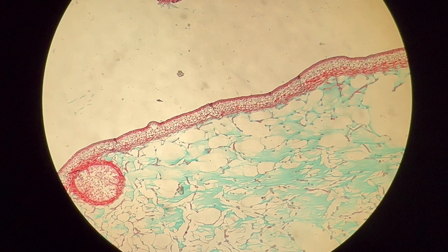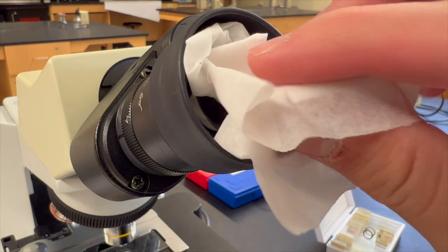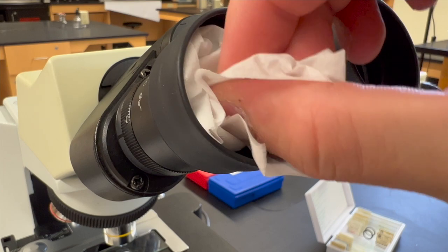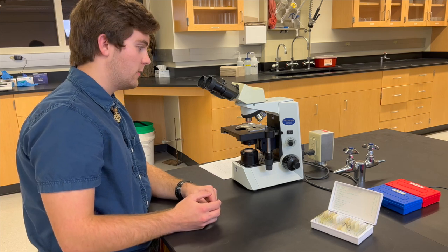It should all be in focus. If there is any smudging that is apparent on a lens, use lens paper to clean both the ocular lenses and the objective lens you are currently using. You should now have a specimen in clear focus using the 4x objective lens.